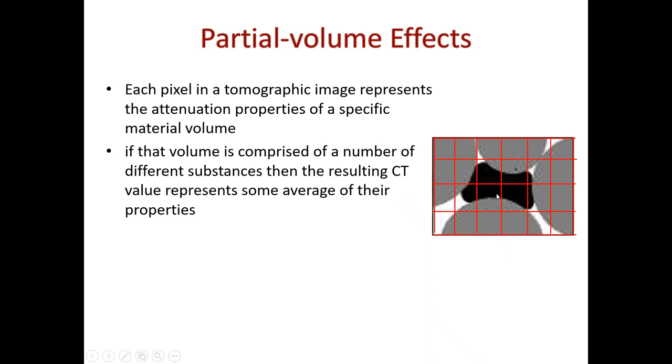So sometimes, let's say that my pixels are like this. I will capture sphere, sphere, sphere, sphere, blob of air, water, water. Okay? So this pixel here, if I downsample this data, I'm going to average 3 different materials here. And that's the reality. If my pixel length was actually this, this image obviously has much more detail because I see all of the detail. But I can already see on this interface a little bit of this pixelization happening. Right? So that's something that is always there.